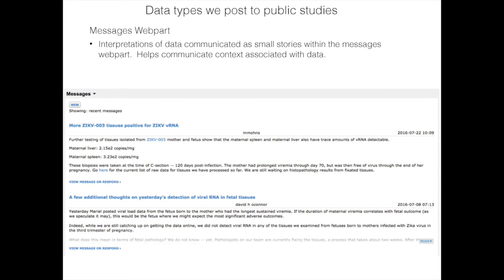The messages web part is a LabKey feature we use within sub-studies to communicate little stories of data — things that maybe aren't core data like a viral load over time, but are more one-off data collection efforts that happen for different parts of the sub-studies, like doing tissue biopsies or notes from my boss. This helps communicate the context from which the data was generated.